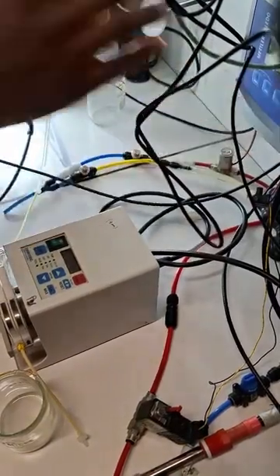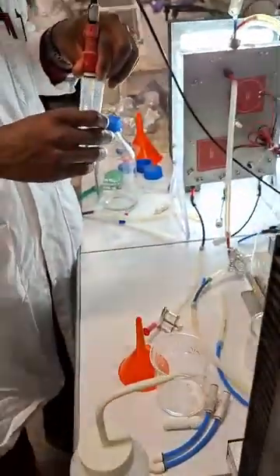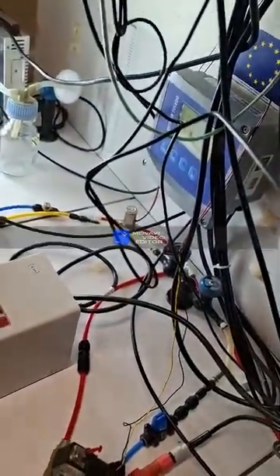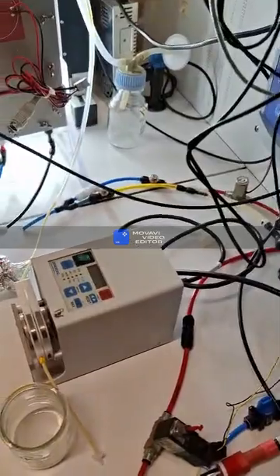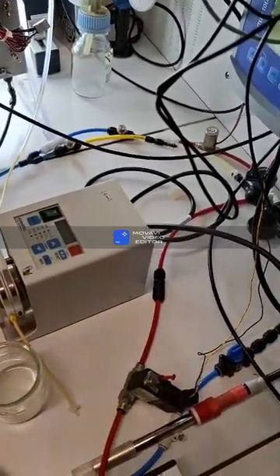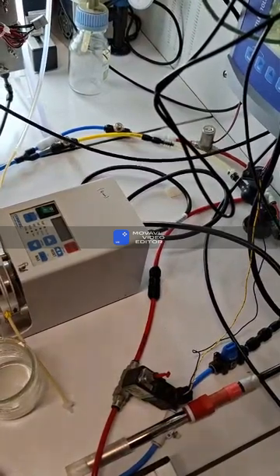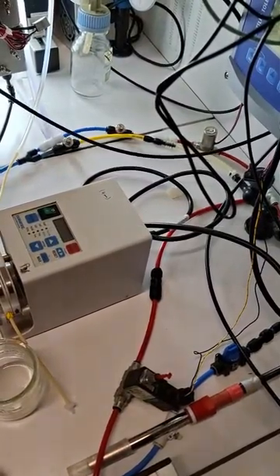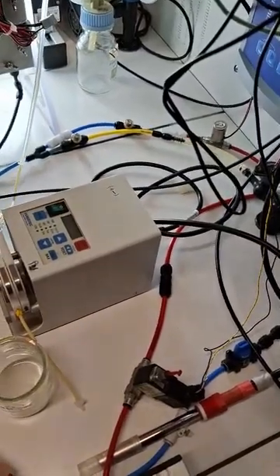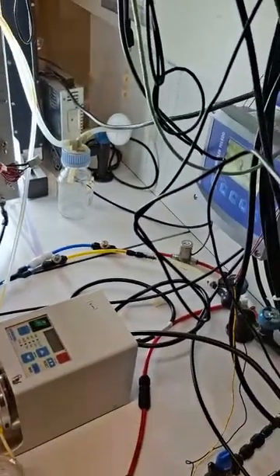Just push both at the same time. Just verify. You have to reach the same. Normally it should be, but we have a little delay. You just have to wait. But I think it's good because it's not a big difference. Okay, so now it's good.